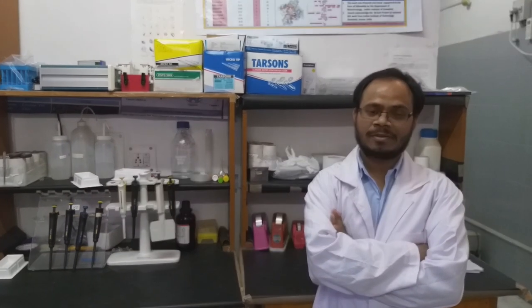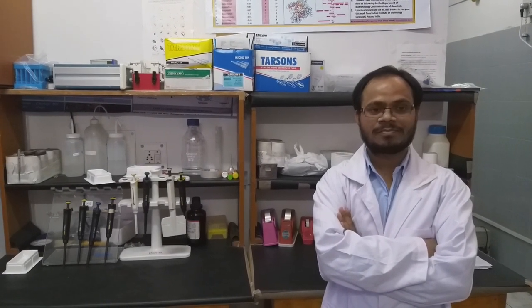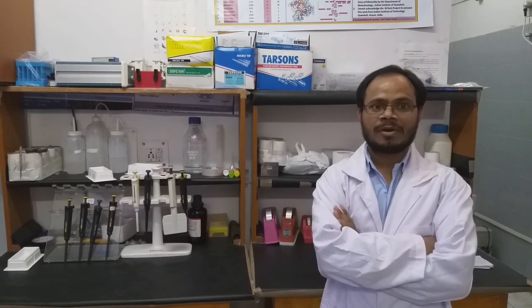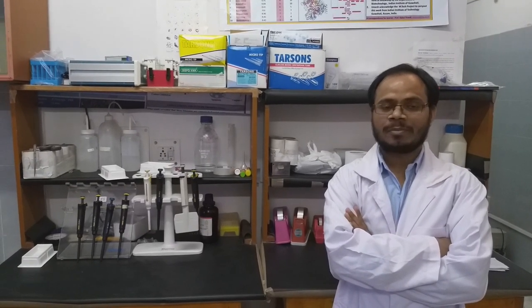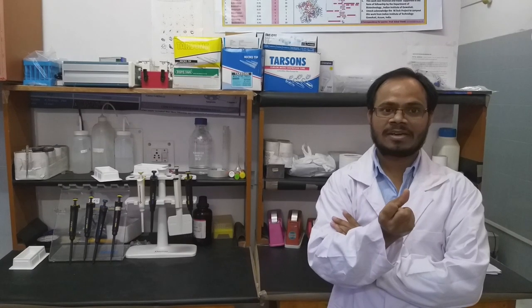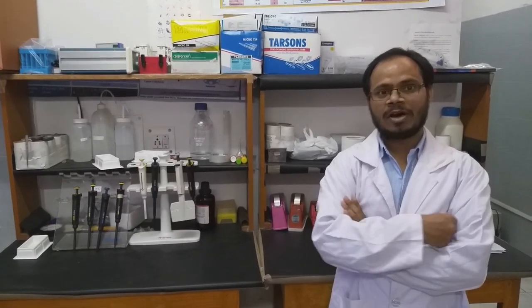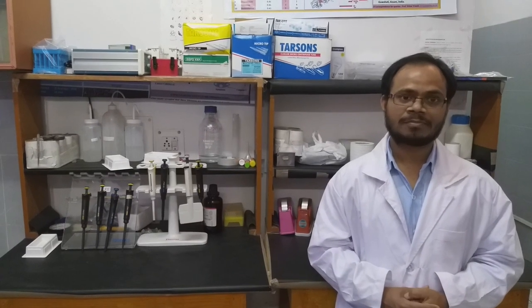To conclude the video demonstration, we have discussed how to prepare bacterial culture media, how to prepare cotton plugs and autoclave it. While weighing the media, we have to make sure that the media components are not exposed to air, because those substances absorb the moisture and become liquefied. Another thing is that for cotton plug preparation, we have to take a single layer of cotton, then we have to fold it.